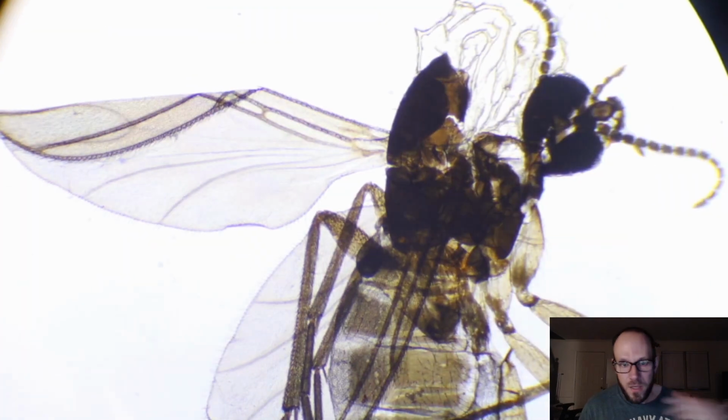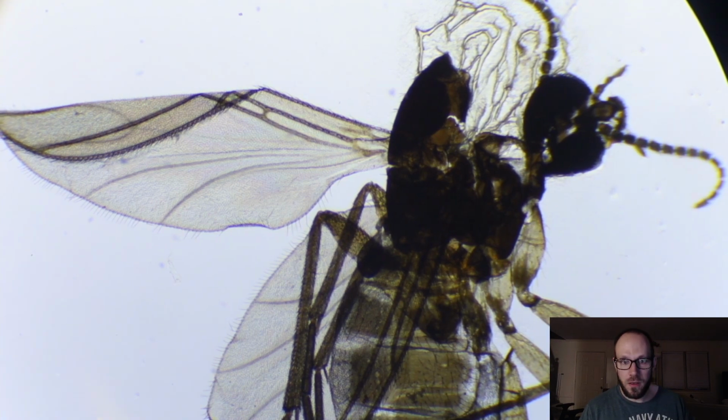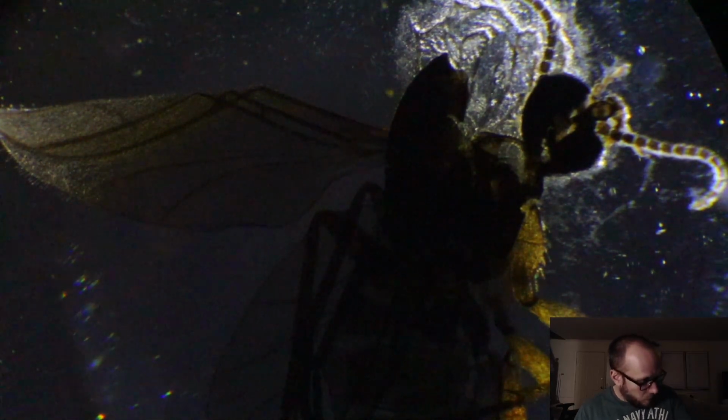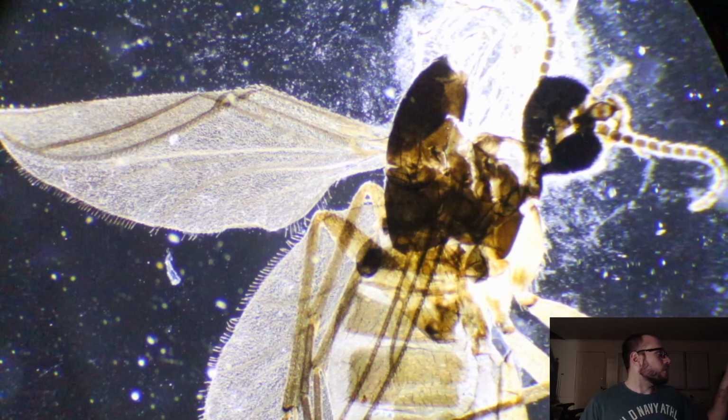But let's go back. One of the best aspects of this microscope, in my most humble opinion, is the Darkfield. Bam. And what we need is more of this. Interesting that it's doing... Oh, I bet I know why. There we go. Bam. So, let me just turn this back down a bit.